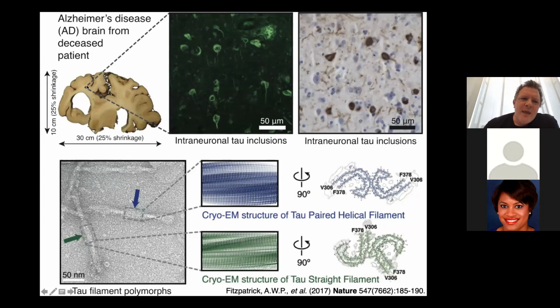So here we take an Alzheimer's patient, a few grams of tissue, and we purify out a filament formed by the tau protein, which is shown here in an image. You see these halos. Those are halos of tau filaments built up inside neurons, clogging the neurons and contributing to cell death. We've characterized them further here using antibody staining.